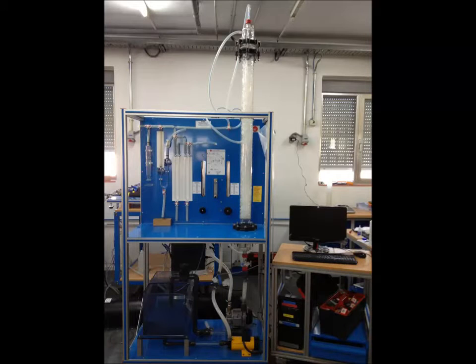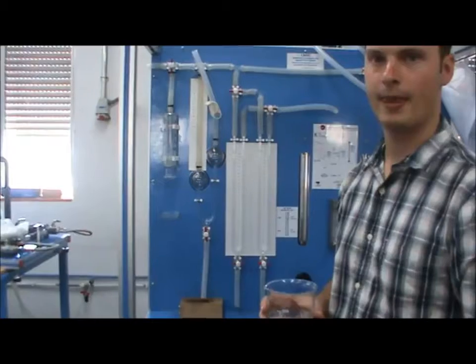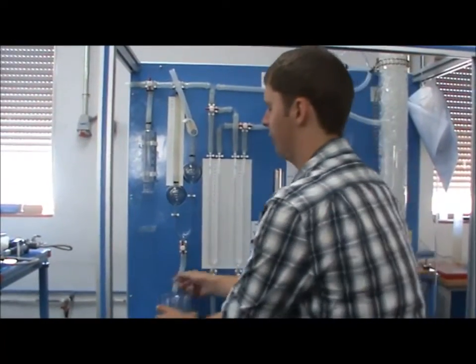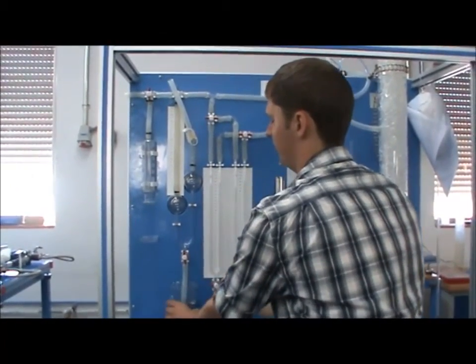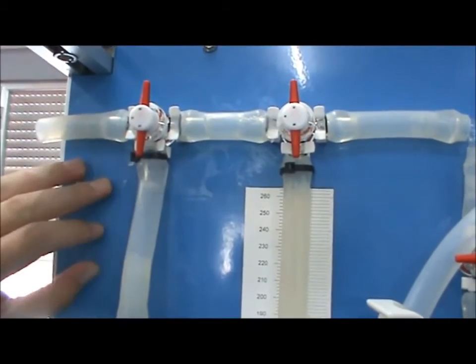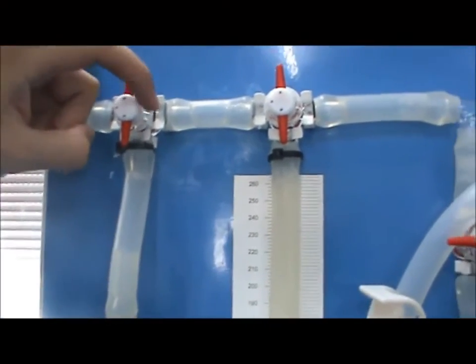In this video, I will demonstrate how to determine the CO2 content in an airflow using the CAGC unit. First, fill the container with this KOH solution and place it here, like this. Each valve has 3 dots which show the path of the airflow. The side without the dot is closed.